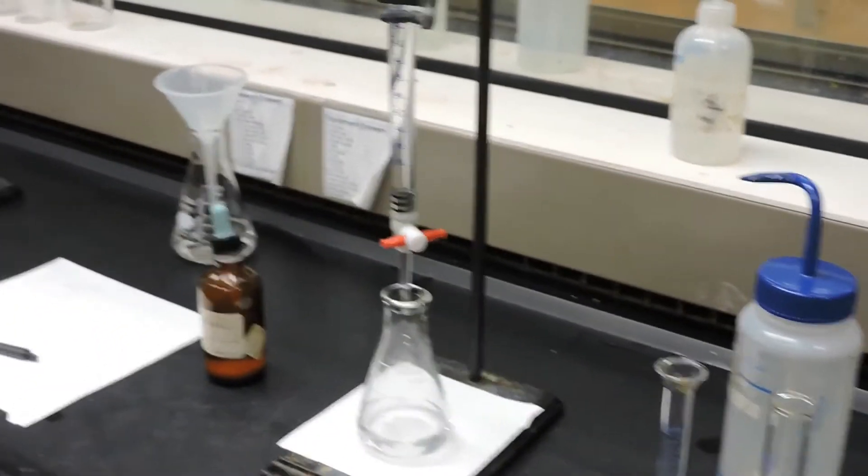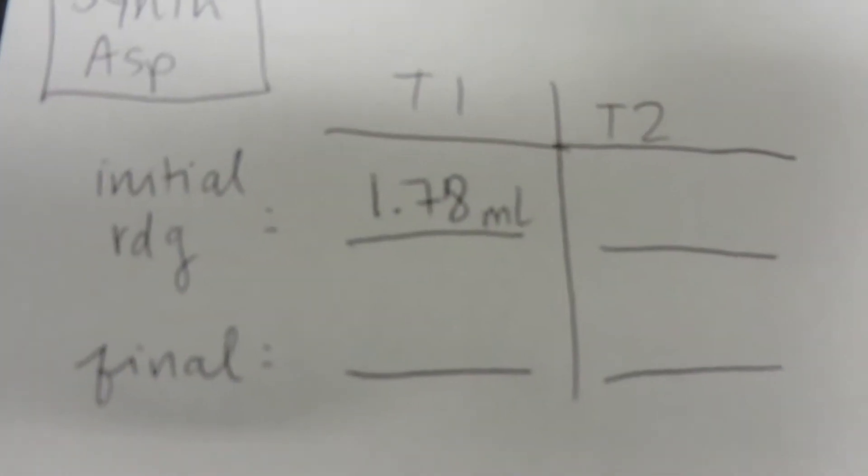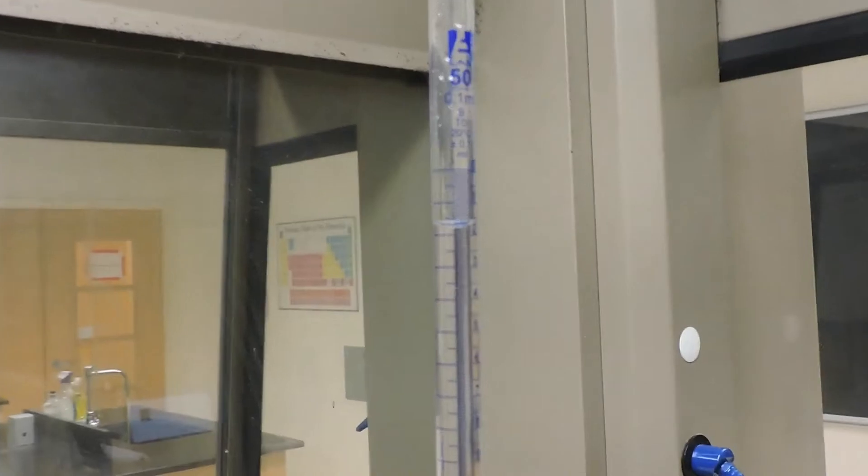Here we have prepared a 50 milliliter burette with our previously standardized sodium hydroxide solution. The initial volume of this burette reads 1.78 milliliters.